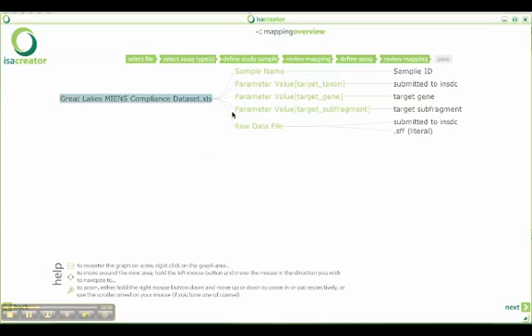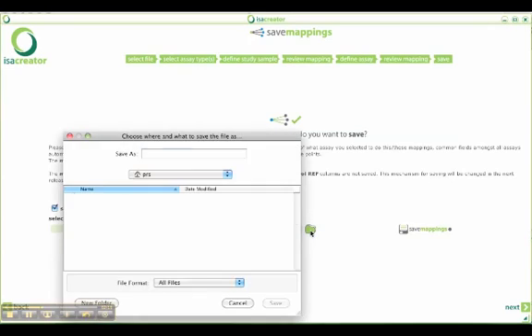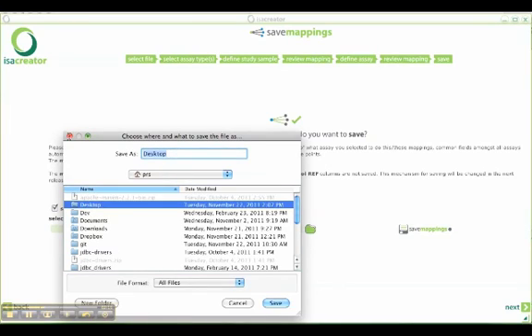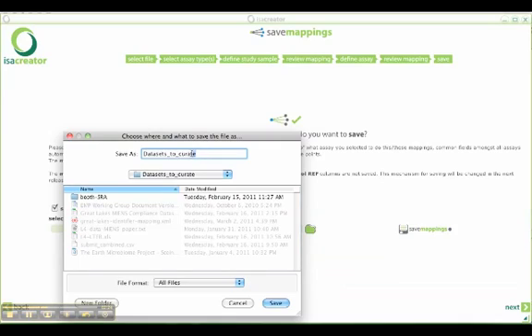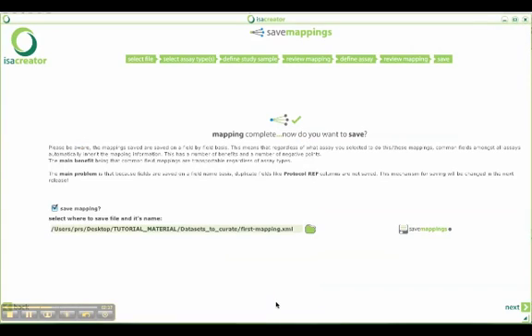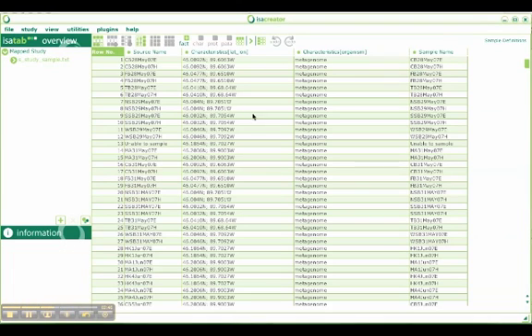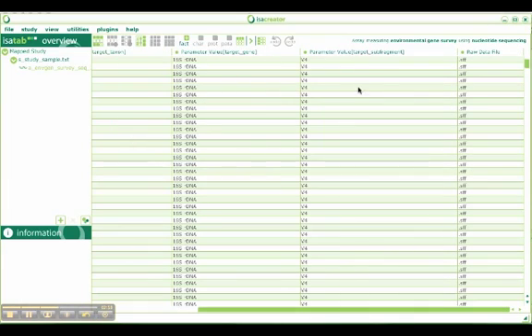And if we are happy with this mapping, we can proceed, save the mapping, by providing just an initial mapping file. Let's save it under the tutorial material folder. Here, first mapping. Saved, click the Save Mapping button, saved, and then proceed. And there we are. We've imported information. These are the samples. We recognize the latitude, longitude, the default organism for the sample section, and then for the information about the target gene, we have this information. This is it for the mapping.